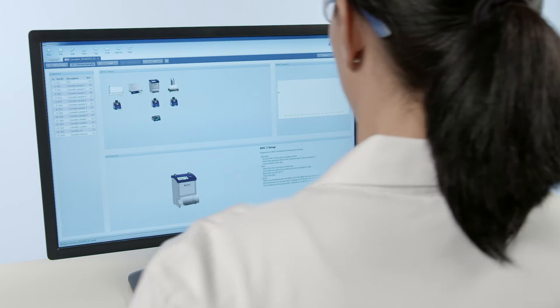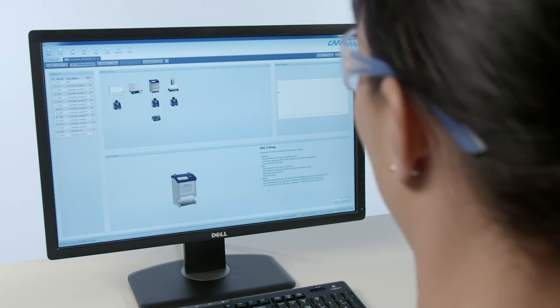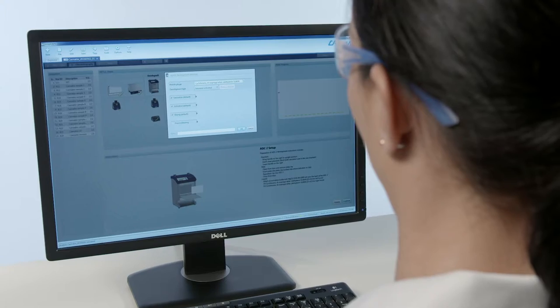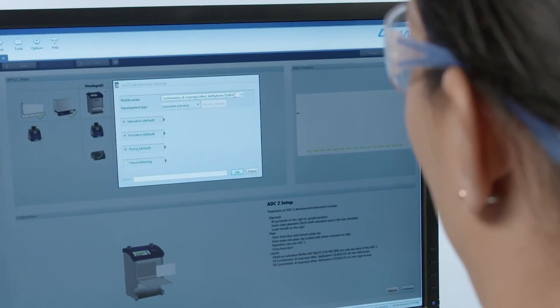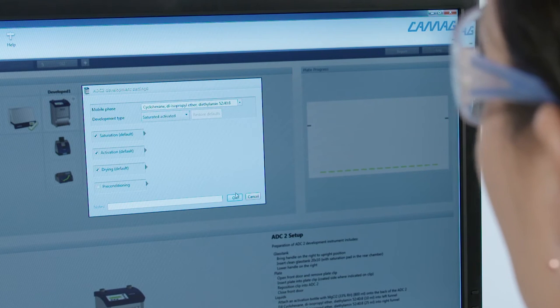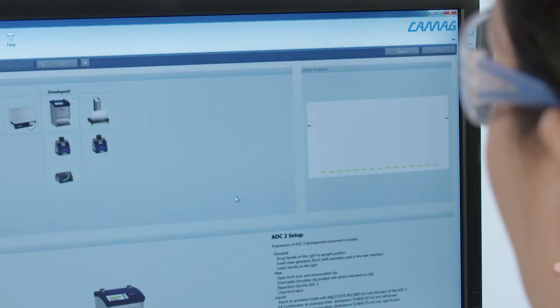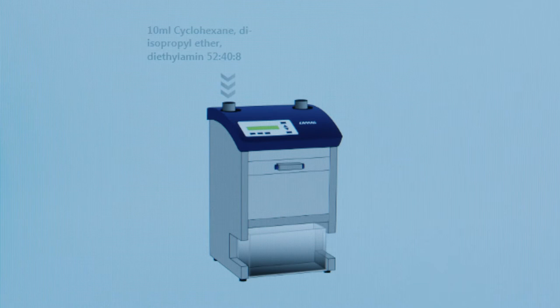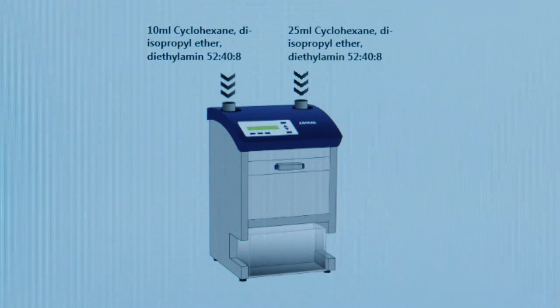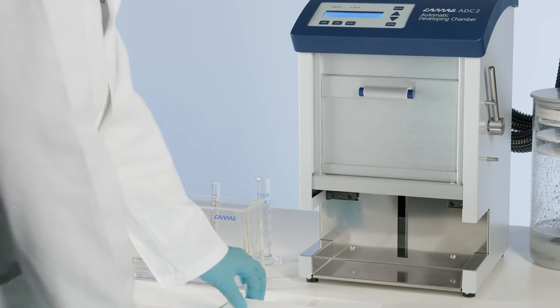The activation of the plate, preconditioning, chamber saturation, developing distance and final drying can be preset and monitored using the VisionCats HPTLC software. With its guided approach, VisionCats effectively leads you through the entire chromatographic process, step by step.